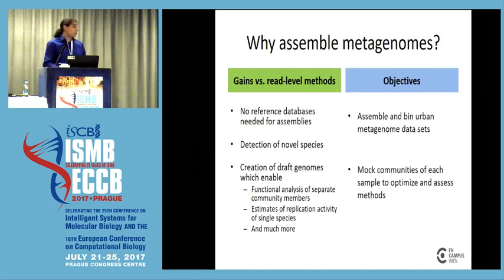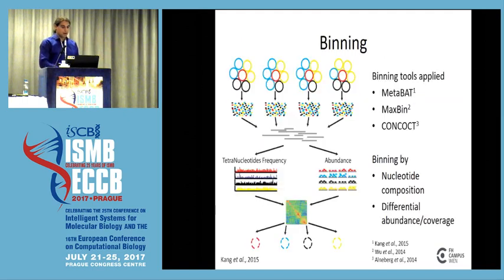So what were my objectives with this challenge data set? I wanted to assemble and bin the urban metagenome sets, and to have a kind of control, I used mock communities of each single sample to optimize and to assess my methods.